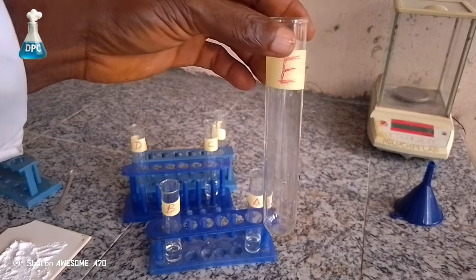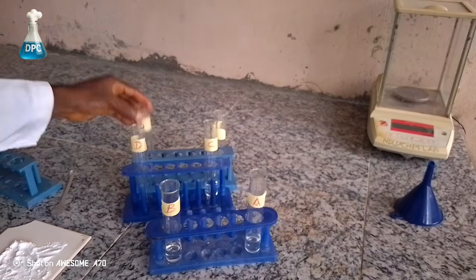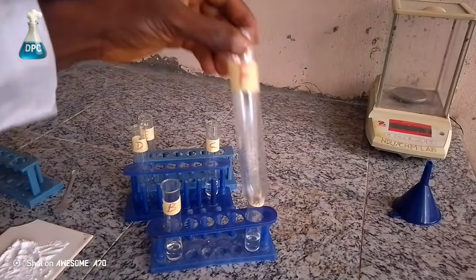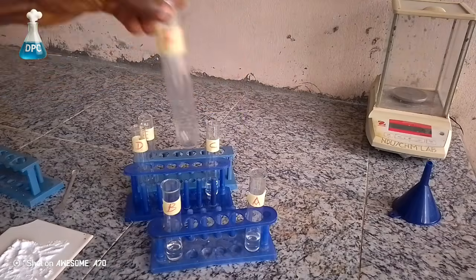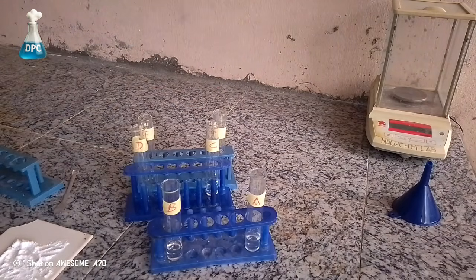Test tube E will contain 3 ml of the acid, which is vinegar. Then test tube F lastly will contain just 1 ml of the acid.